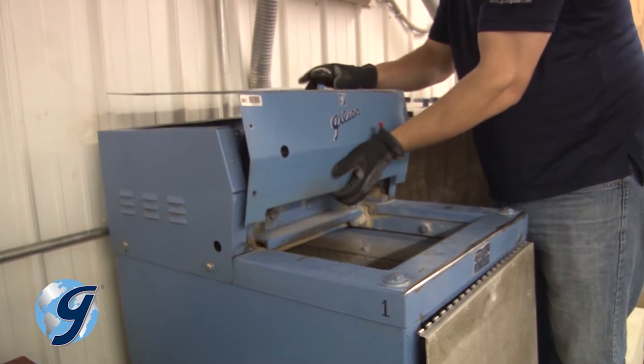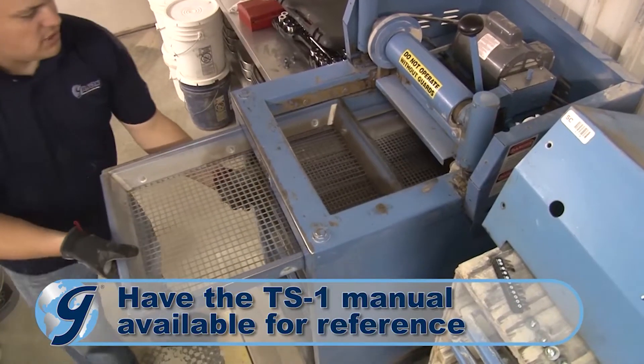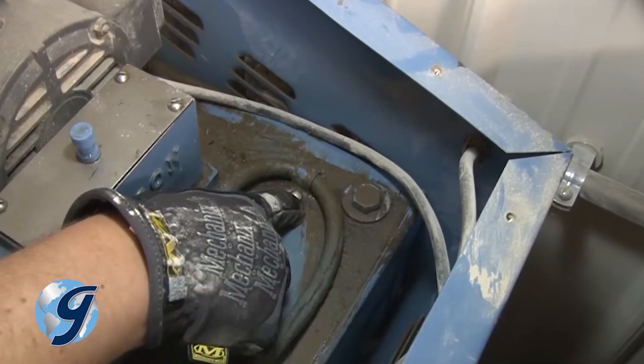At this point we've unplugged the testing screen, removed the top cover, unfastened the side cover, and removed the screen trays. Now remove the clips holding the hydraulic lines.